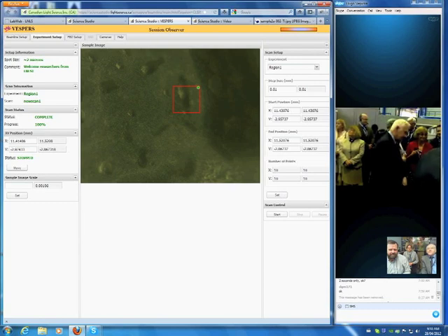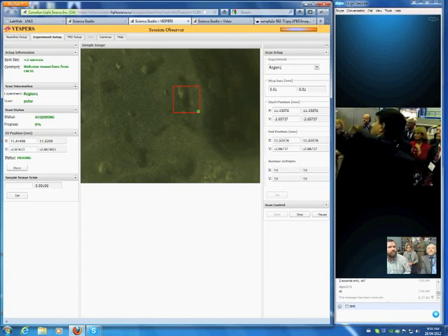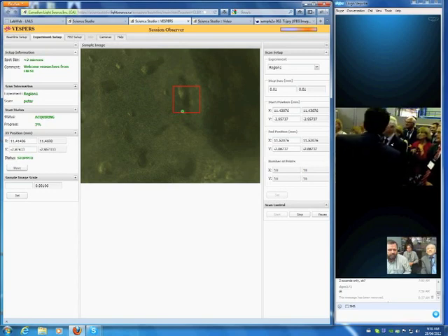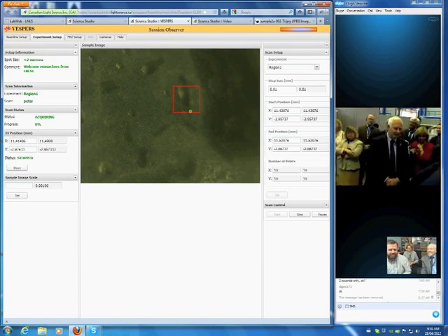Okay, and there we go. Now you can look. You see the room moving? It's going to start. It jumps from one place to the other. Now it's going to jump to the left corner. Let's wait here. Okay, there you are. Now you see that the green dot is the point, and every point that it goes to, it does a spectrum. You see the peaks.